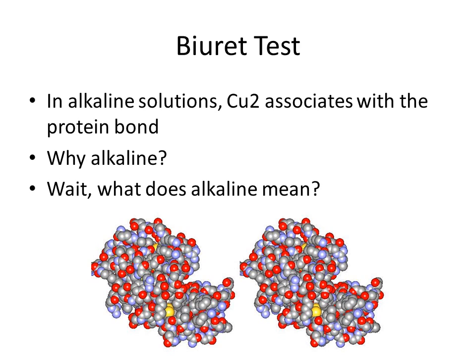But here are the major points of this test. It has to be in alkaline solution. What's alkaline solution? Basic. What's a base? In this case, sodium hydroxide. That's what we're going to be using for this class. Okay. Why do we need to add base to this solution?